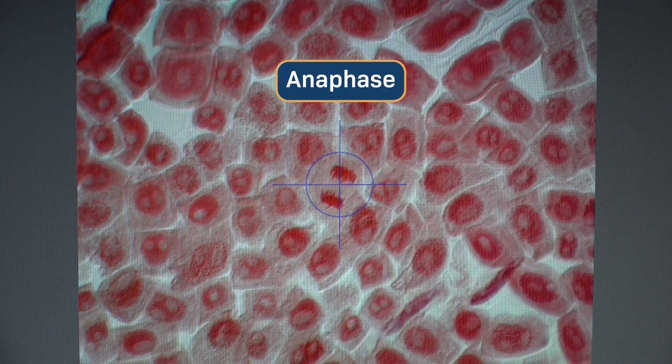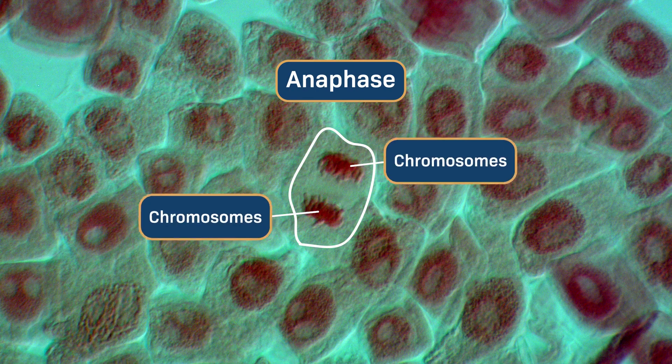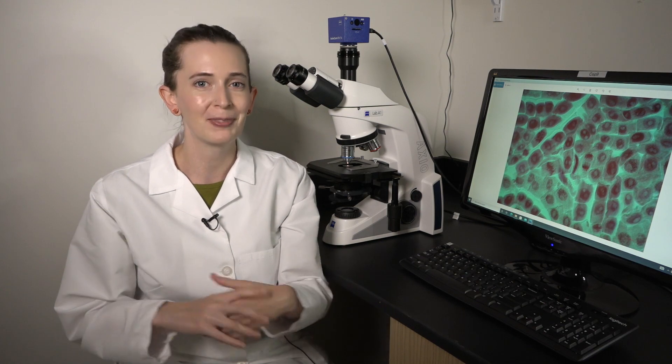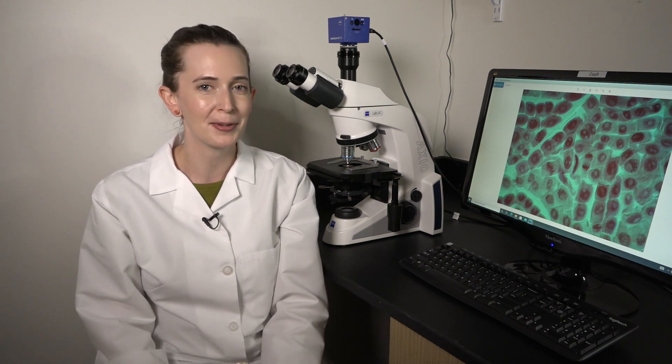Oh my gosh, anaphase! As plain as day. Look at those chromosomes separating. Way to go, chromosomes! Okay, I'm actually not going to show you all of the phases in this video because I want you to explore your own results and apply what you've learned in class about mitosis to recognizing the phases in your own experiment. So go enjoy your very own mitosis scavenger hunt!